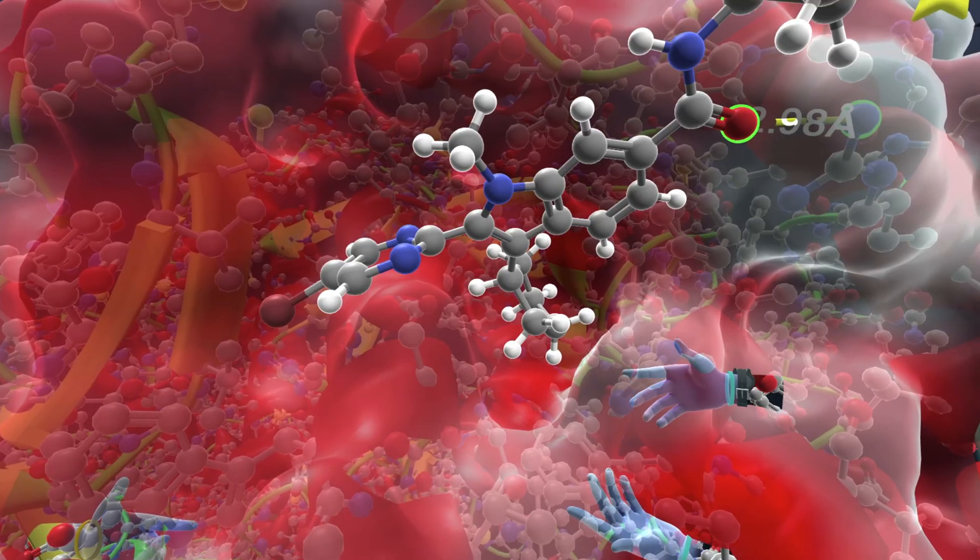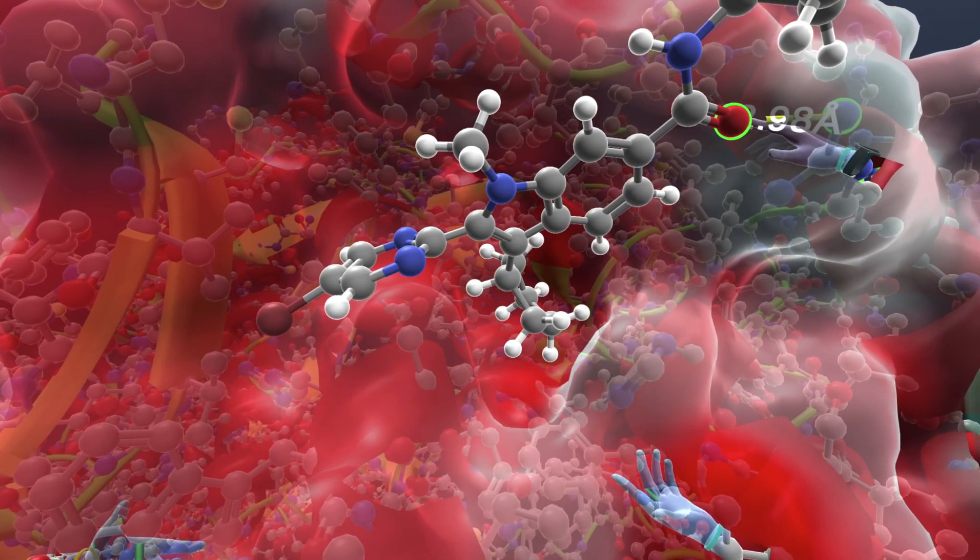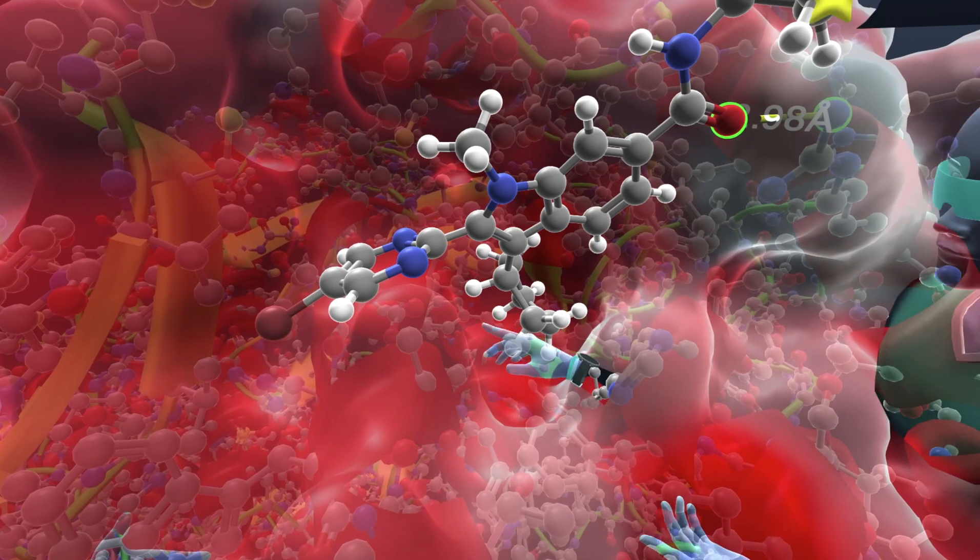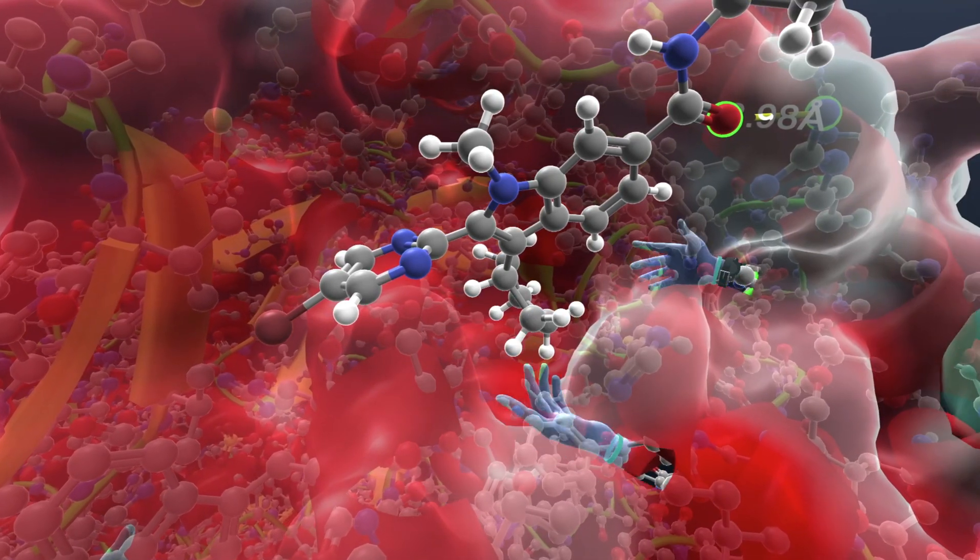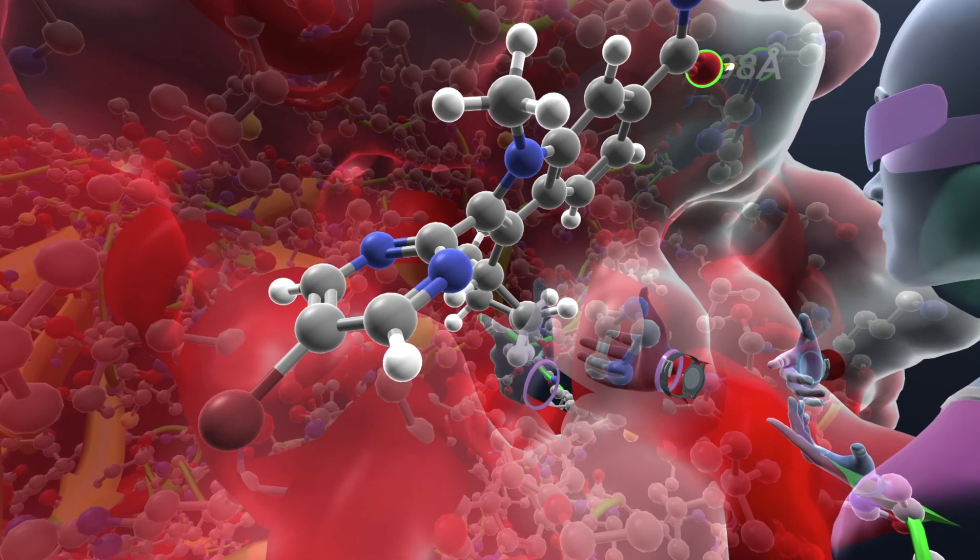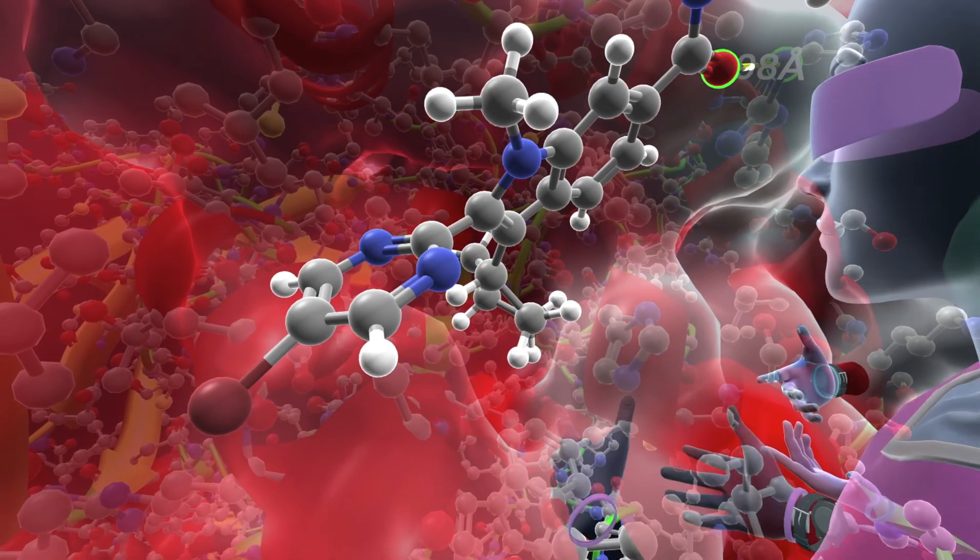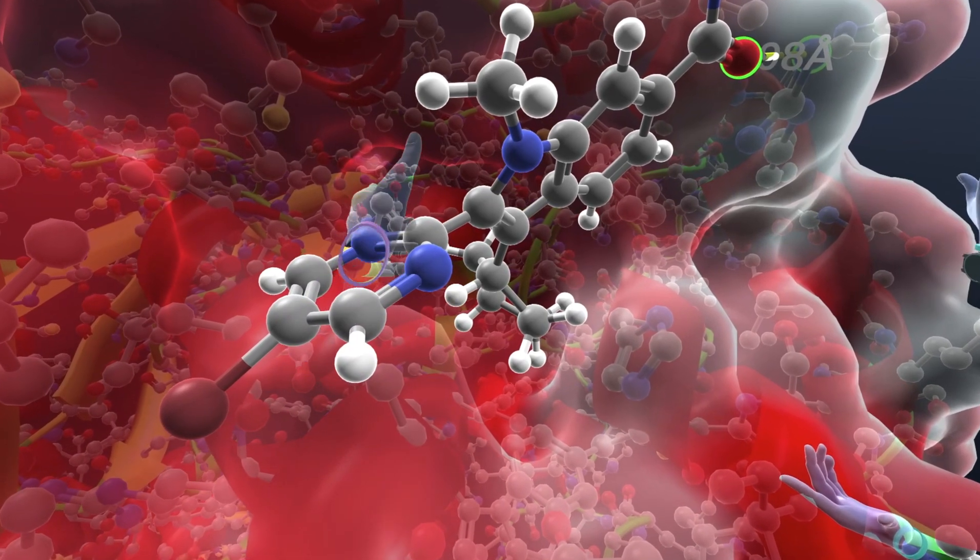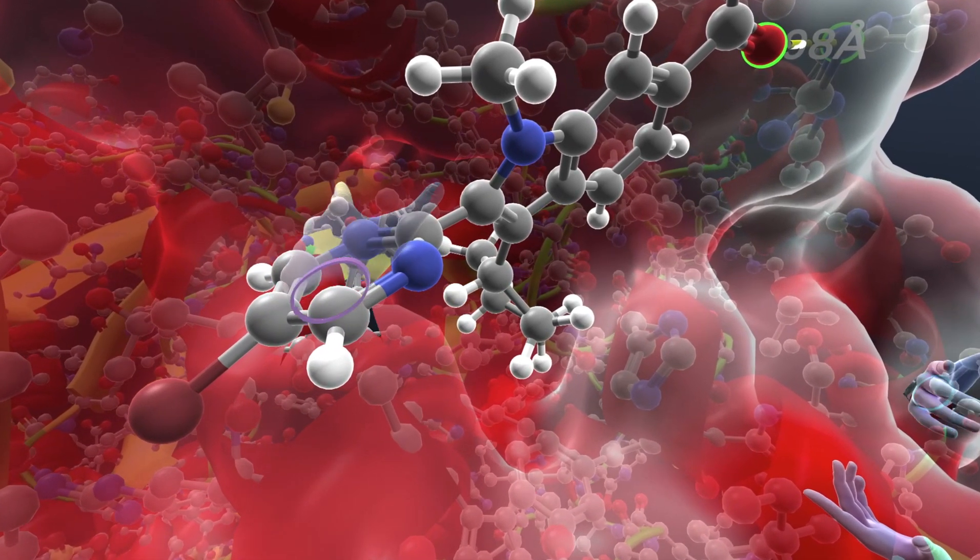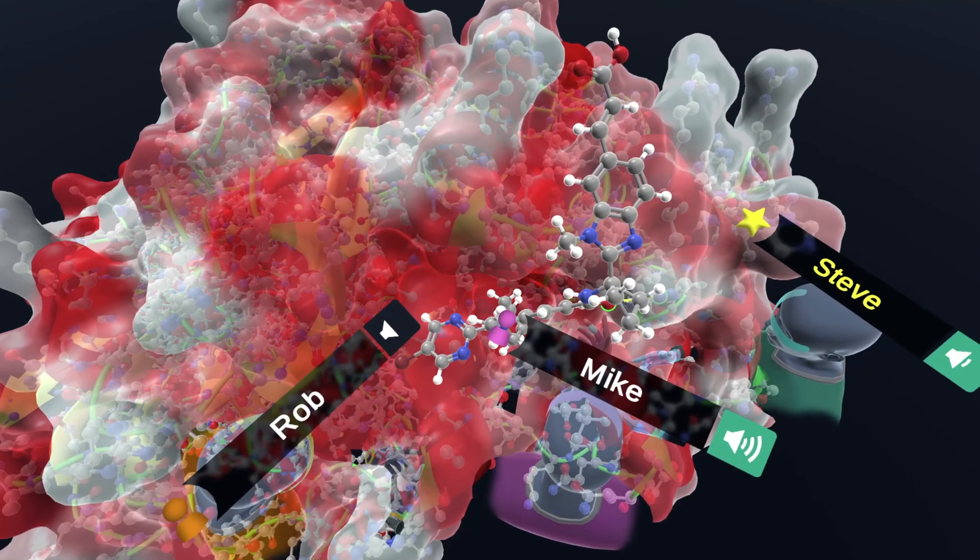We colored the same protein by hydrophobicity instead of by b-factor, so now we can really see the hydrophobic nature of this pocket. This is really cool - we've got a cyclopentane here but it's still down in that leucine sub-pocket, and instead of a furan we have a pyrimidine serving the same purpose in forcing the conformation.